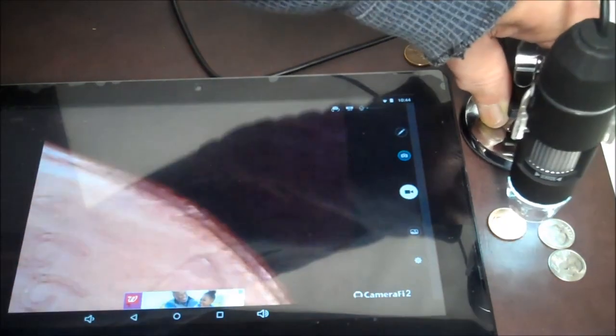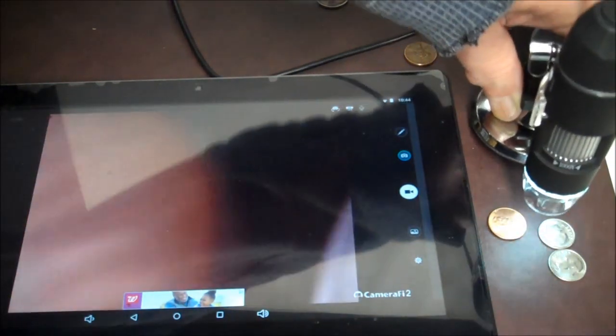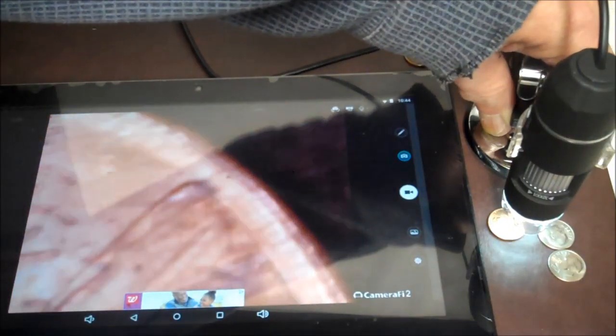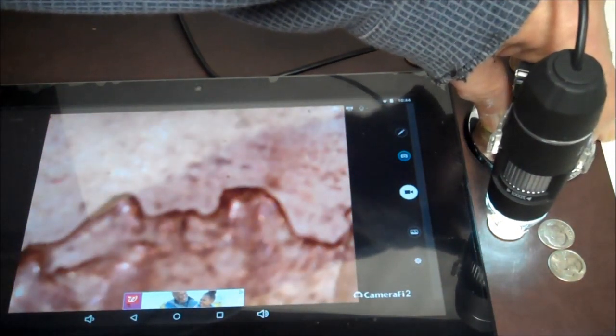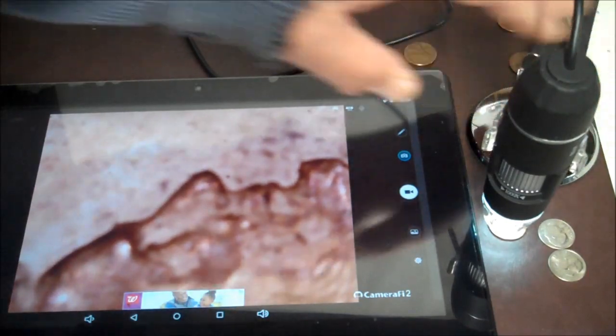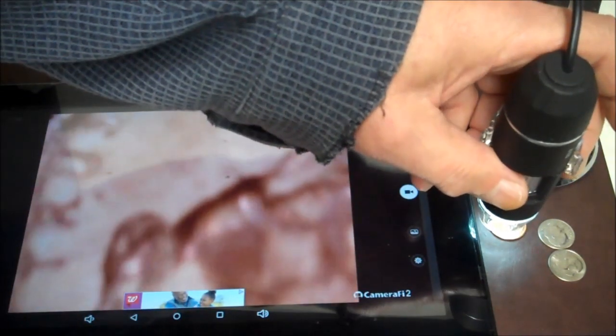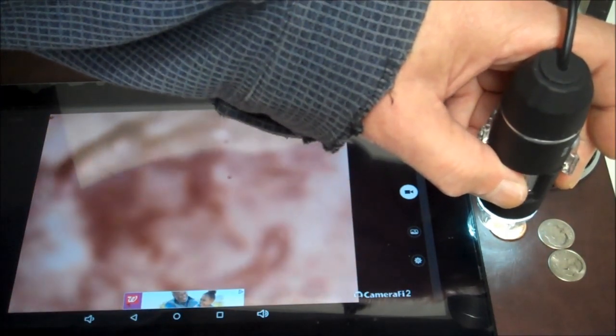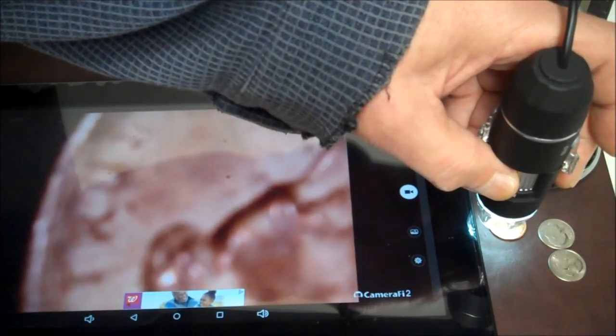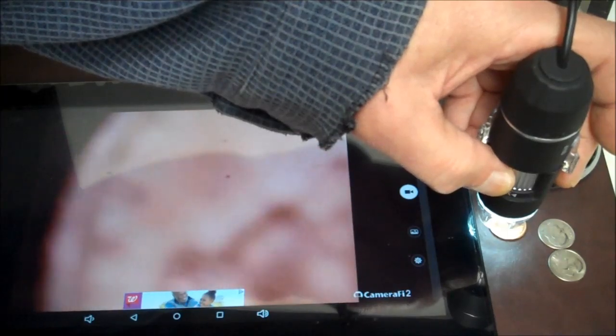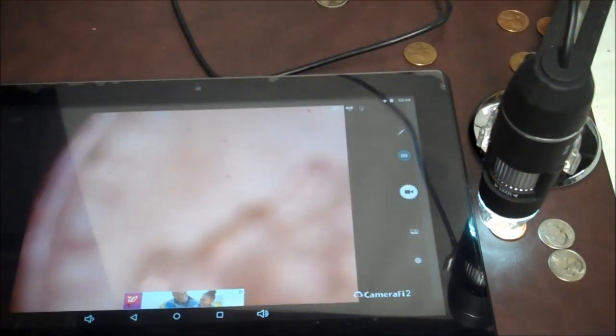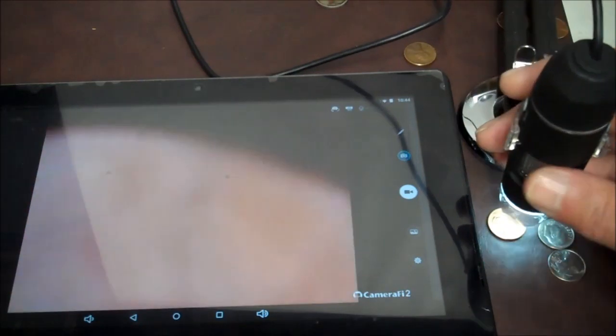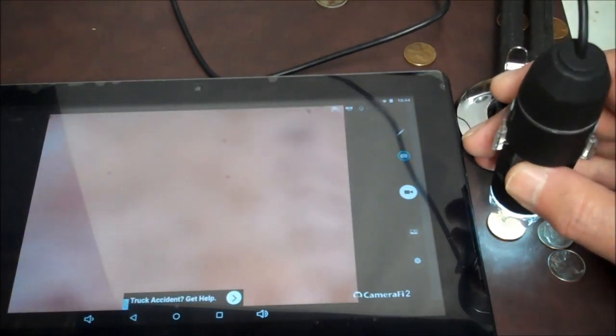But what they're saying is anything after like 30 millimeters away is going to be just like a webcam. So, yeah, you just use this knob and adjust it slightly until you get a nice focus in. Which is sometimes hard to do, especially if you don't have this counterbalance on because it's moving around so much. Let me come on the other side here.